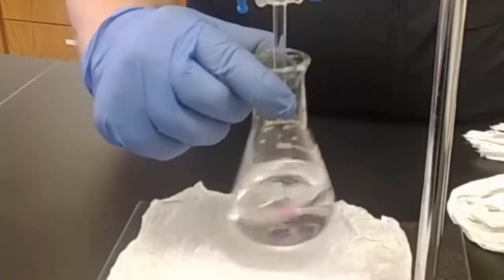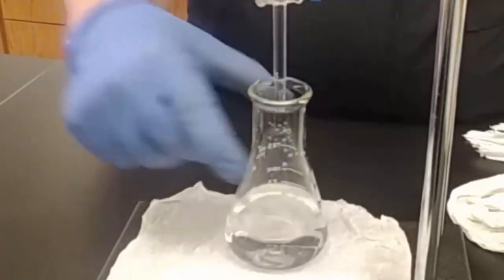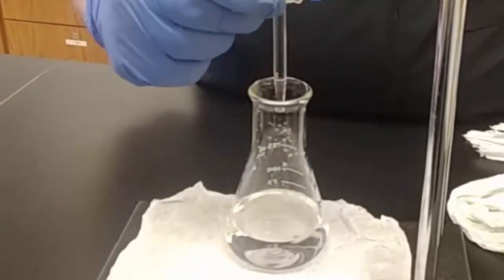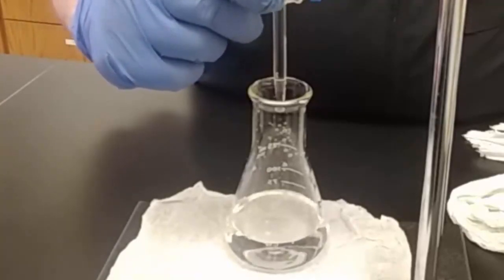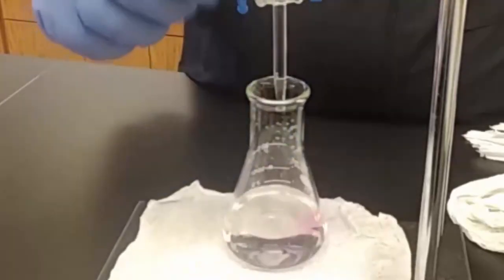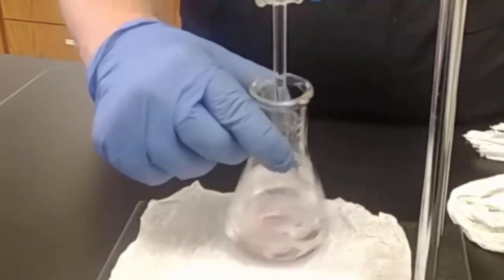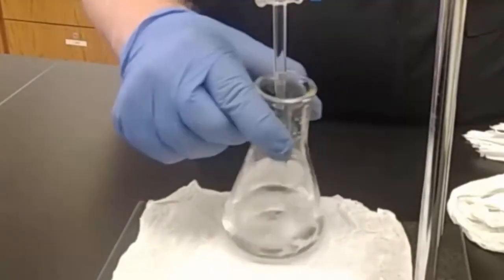It's got to persist for at least 30 seconds. You want to say 30 seconds because if you leave it longer than 30 seconds, it can sometimes turn back colorless because, again, carbon dioxide in the air reacts to form carbonic acid, and it'll turn back colorless. Not that I recommend this, but it's entirely possible.